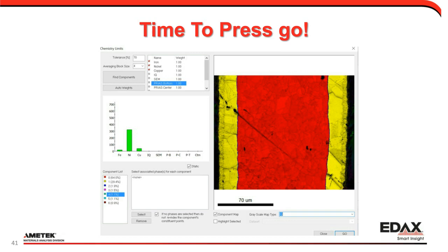Now I'm reindexing that point, in this case based off the Hough. With those Hough settings and these bands, I said, okay, only look at this phase, use this phase, and then go ahead and reindex it. So now I'm able to get this orientation. I no longer have any complications from any other phases, so I'm getting better indexing quality, and with that in the end, better data. So I press go, and we start to index.